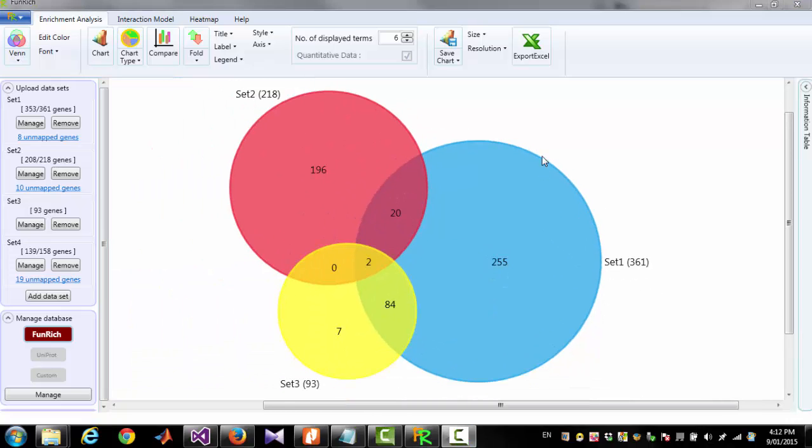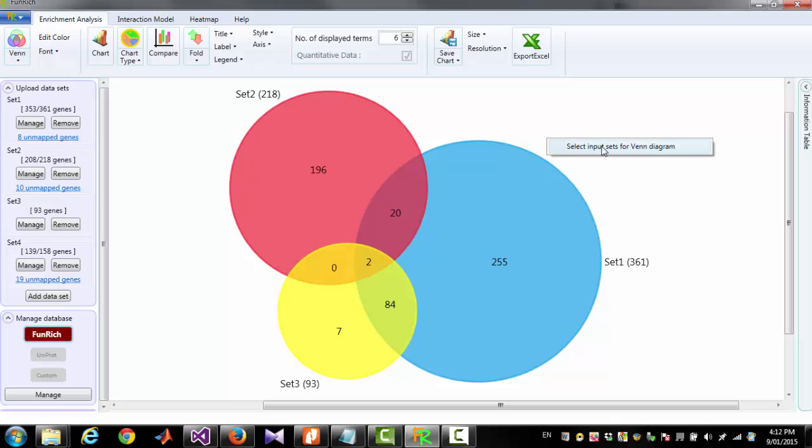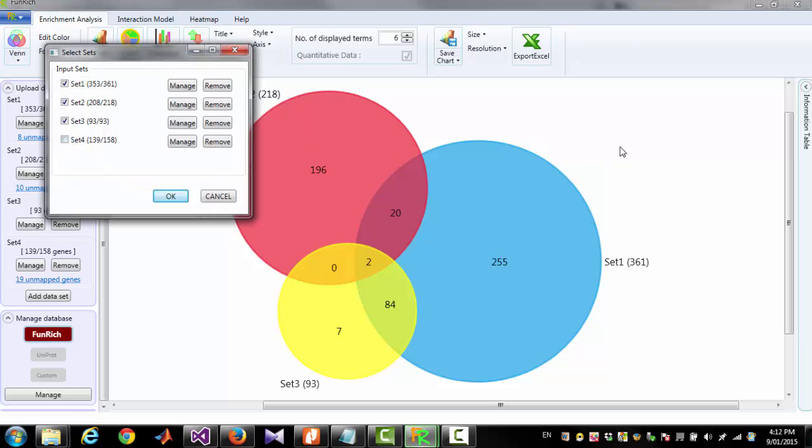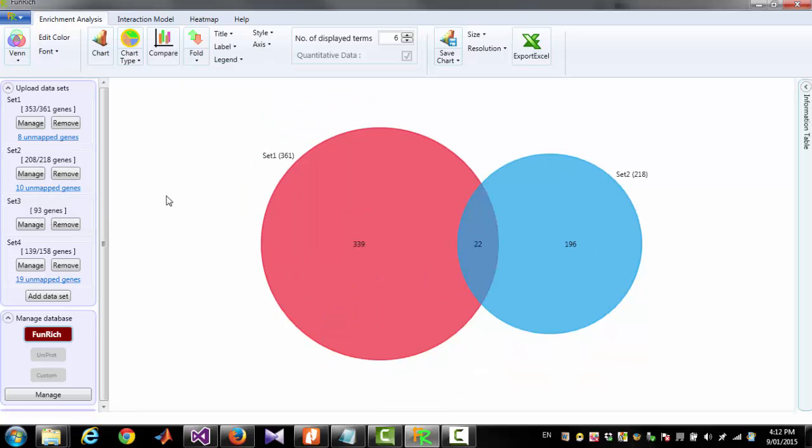Another way to select which set should appear in the diagram is to mouse right click on empty space and click Select Input Set for Venn Diagram. Now I am selecting first 2 sets and this is Venn Diagram for 2 datasets Set1 and Set2.